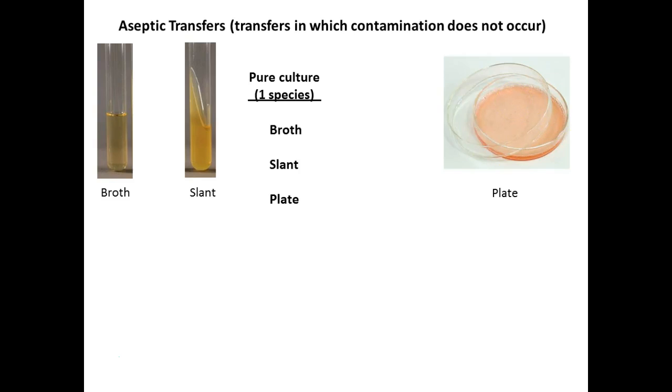The problem with them is that whole lid thing and how big they are, and the separation of lid from top, potentially becoming contaminated. With tubes, getting those lids off is less likely to cause that, especially if you grab the tube by the tube like you're supposed to instead of the cap.